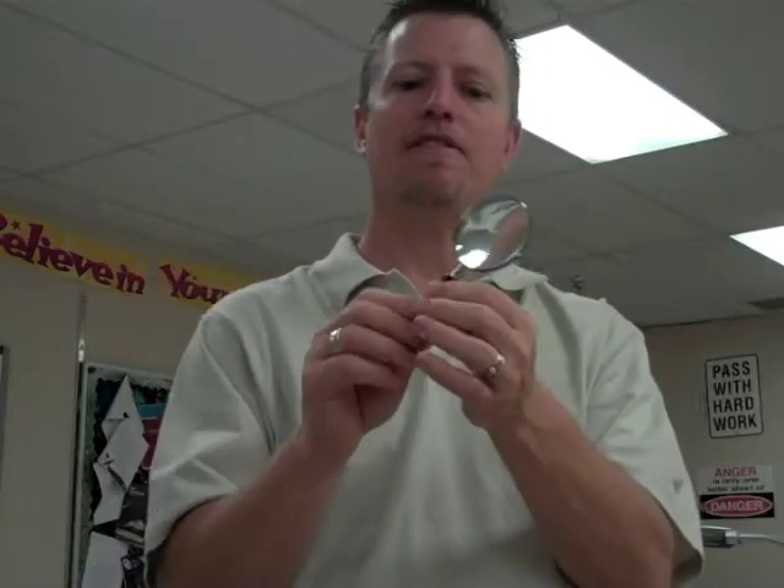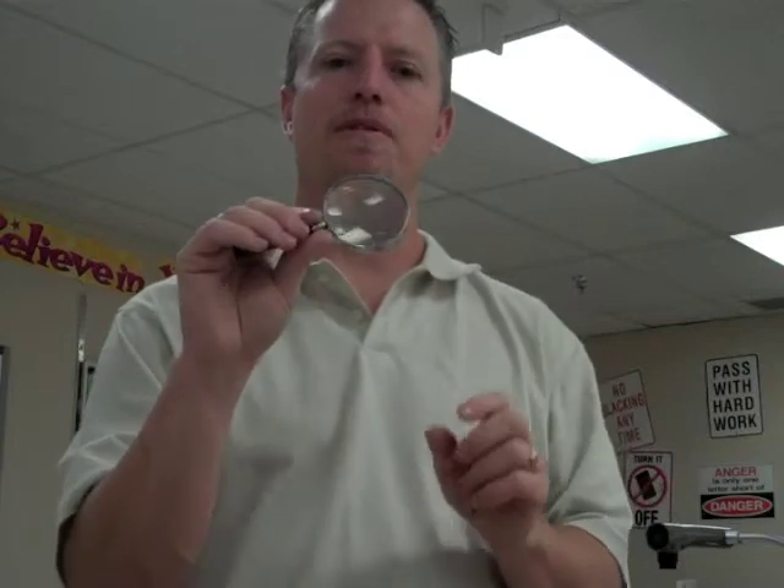This is a hand lens. Lots of people call them magnifying glasses, but in science we're going to call them a hand lens. That's what this will be referred to on the practical.